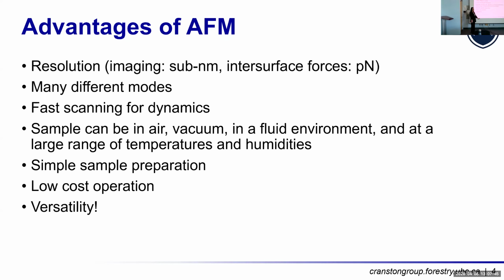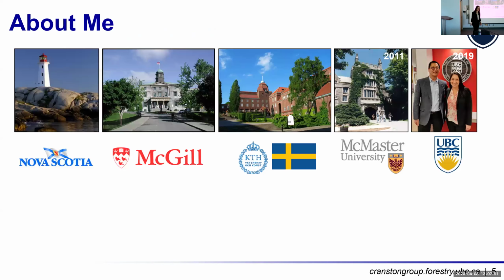Okay, so super versatile, and I'll try and give you some examples today, but really I just want to get you thinking, what can you do with AFM?